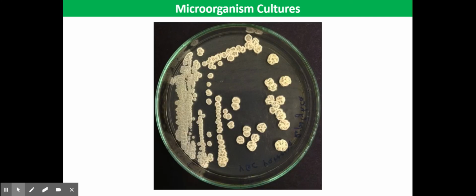First of all, looking at the bacteria. Bacteria tend to grow into visible colonies, which can be shiny or dull. Some colonies are round with entire edges, whilst others can have crenated edges. The colonies can also be a range of different colours, and each colony will result from a single bacterium.